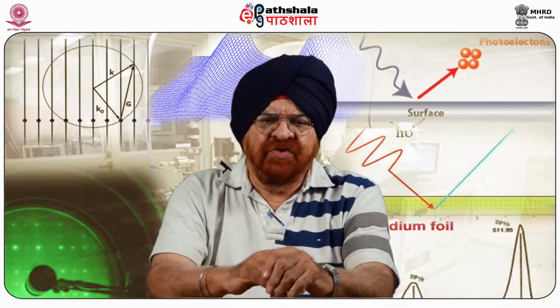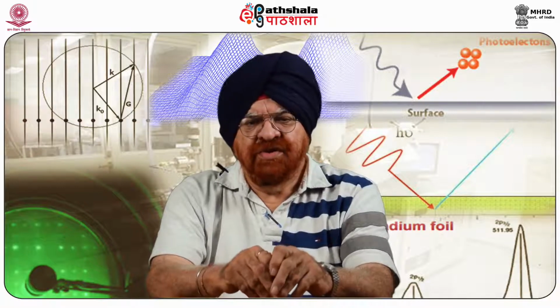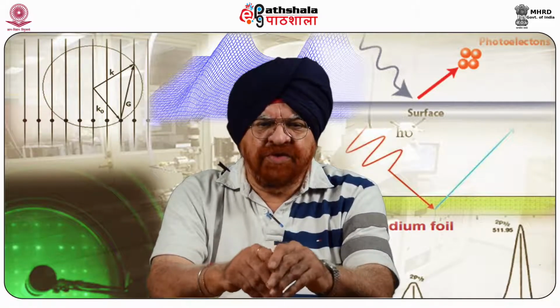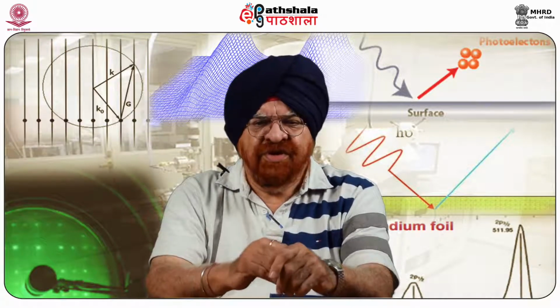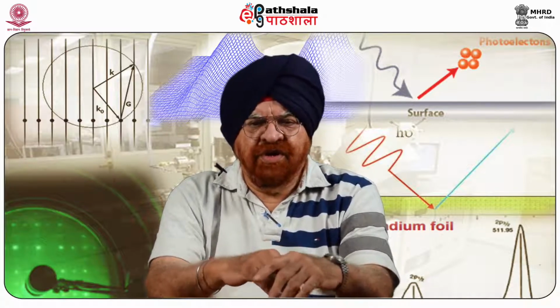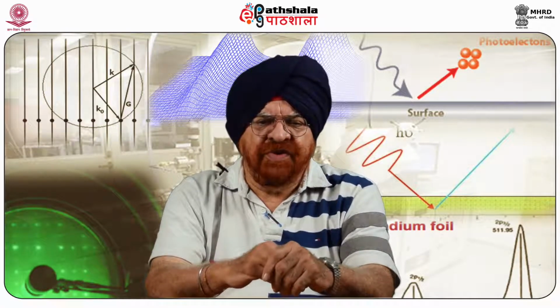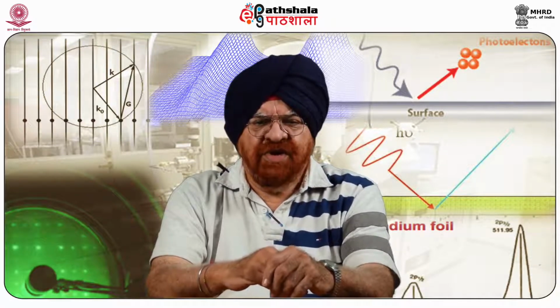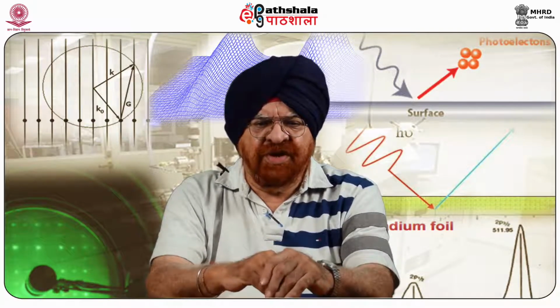KPFM has been used to study the electronic properties of semiconductors, nanostructures, and other surfaces. Electronic properties of defects on clean semiconductor surfaces have been investigated by using sub-nanometer resolution KPFM. High resolution KPFM has been successfully applied to the study of a variety of adsorbates and their interaction with semiconductor surfaces.